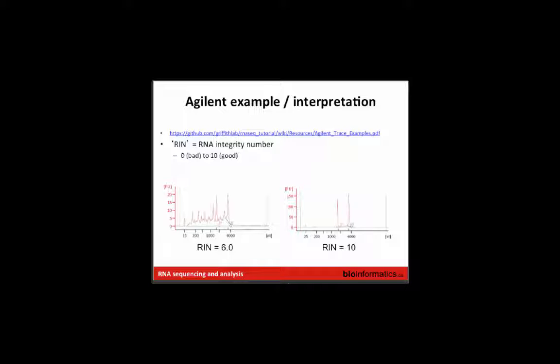And then as your RNA starts to degrade, you start to see secondary peaks. Where the RNA has been broken into pieces, you start to get peaks on your gel, so to speak, at smaller sizes because the RNAs are being broken down into smaller and smaller pieces. So you start to get what would look like a smear on the gel, but here looks like all of these extra peaks, and this gets translated into a score that tells you that there's some amount of degradation.